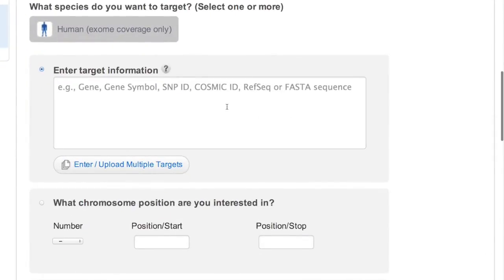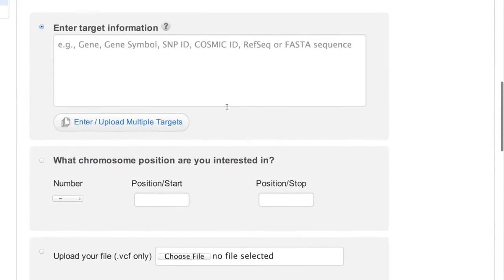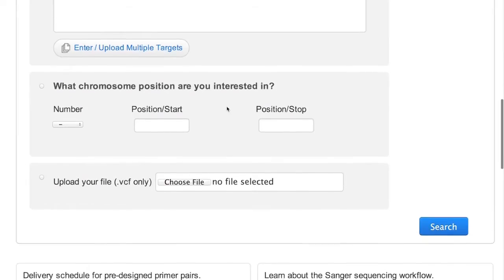Starting your search is easy. You can search by keyword related to your target, chromosome location, or import next-generation sequencing results using a VCF file format.